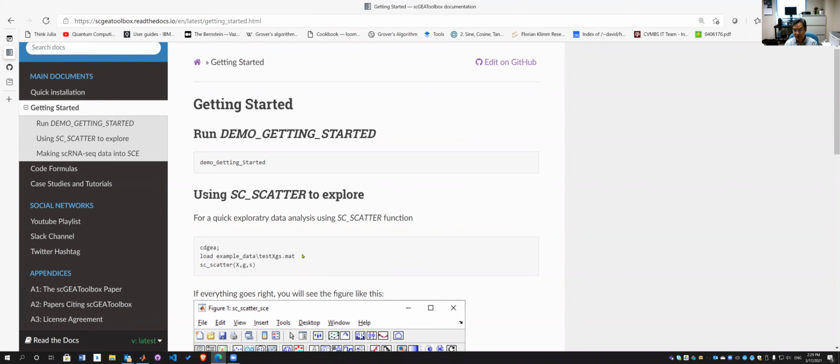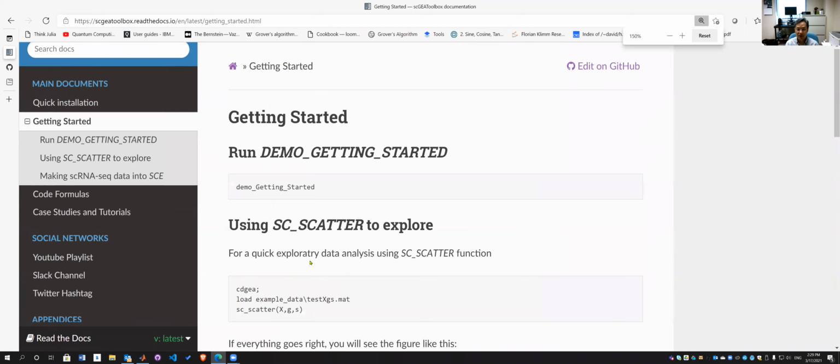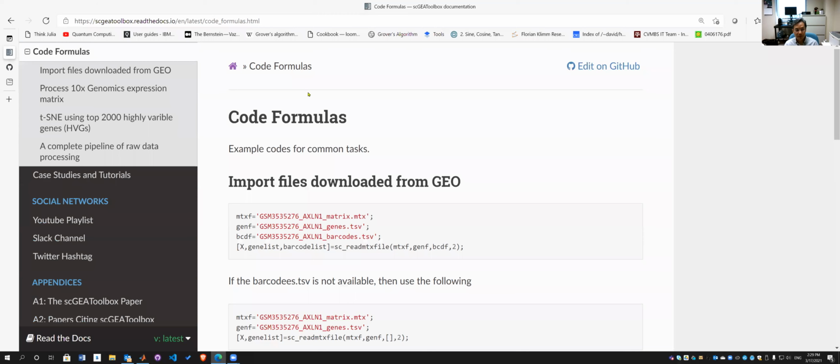But for your own project, your task will be to go out and find an interesting paper, locate where the published data is, find it online and find a way to download it. So that's where I put example code here.